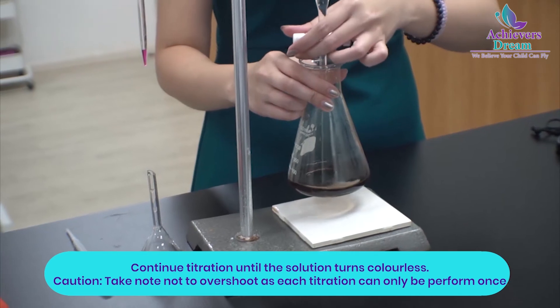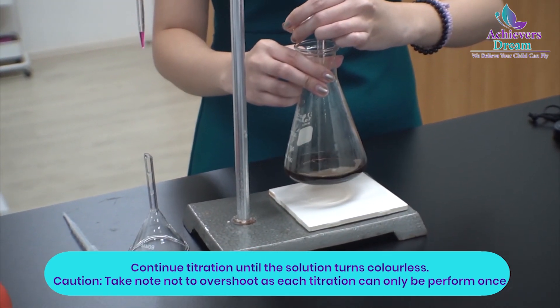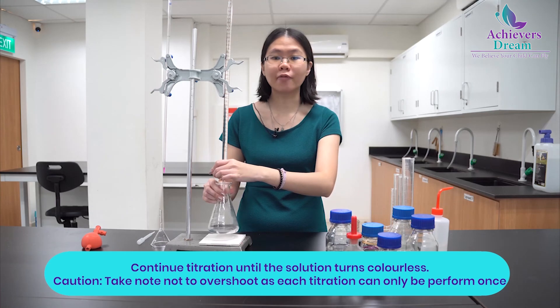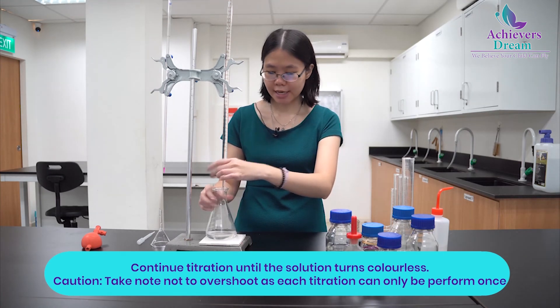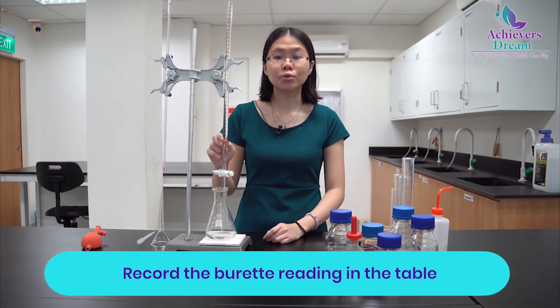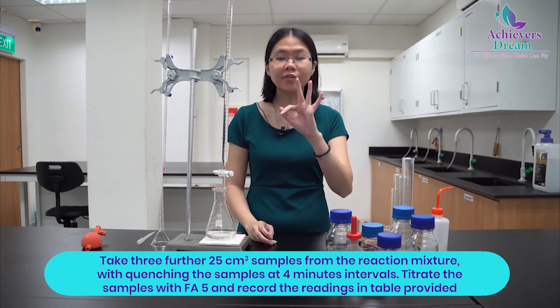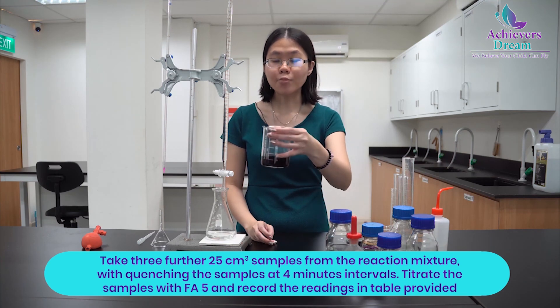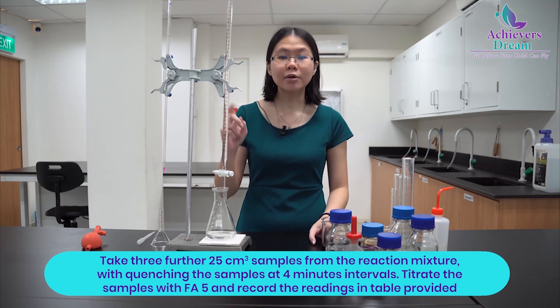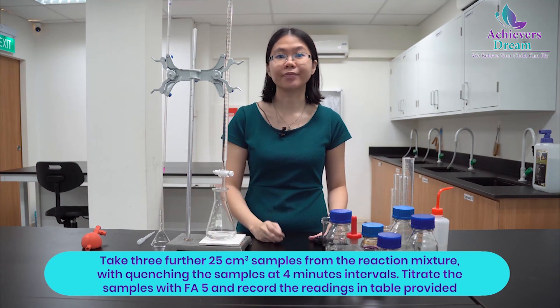Continue to titrate until the blue-black mixture turns colourless. Take note not to overshoot because you can only perform each titration once. Record your titration reading into the table provided in your experimental worksheet. You will need to take 3 further 25 cm³ samples from your reaction mixture and repeat the quenching and titration steps, with the quenching of each sample at 4-minute intervals as shown in the table.